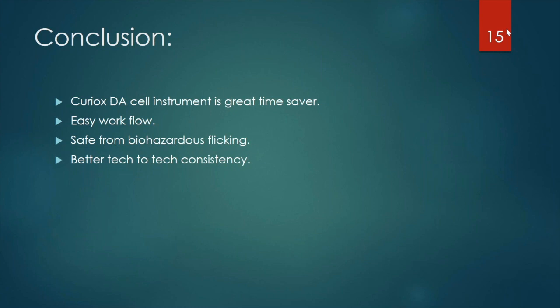But that doesn't happen. It's not individual nozzle-wise washing. As I see, the whole liquid is pushed at once into all the nozzles, and it is taken off. It's aspirated all at once. So it's not different tubings going to each of the nozzles, as I believe that's how it is.